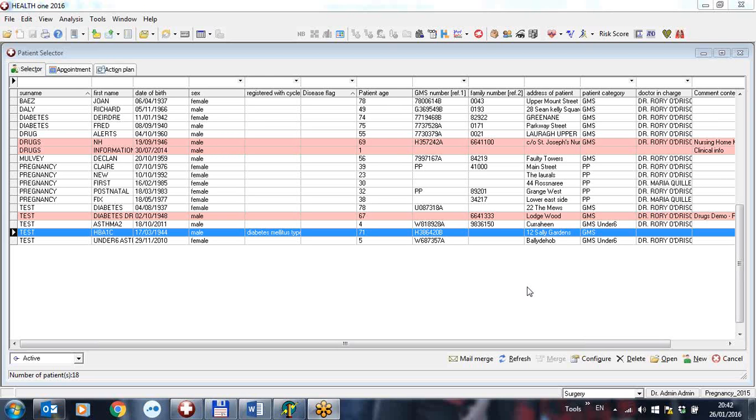Today is Tuesday, the 26th of January 2016. In this video I'm going to discuss the mismatching of lab results such that you can't analyze them.